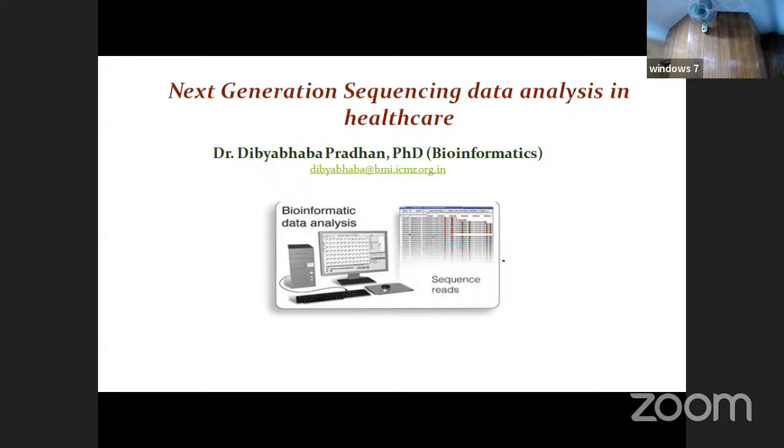Okay, you must be aware of the whole genome of human. Okay, the human genome project. How much time has it taken? It has taken something around 12 years. Whereas nowadays within 2 days you can sequence the complete human genome due to NGS technology. Okay, in this lecture basically I am going to touch upon what the NGS technique is and how we will be analyzing the NGS data. Okay, mostly I will be focusing upon analysis of NGS data.